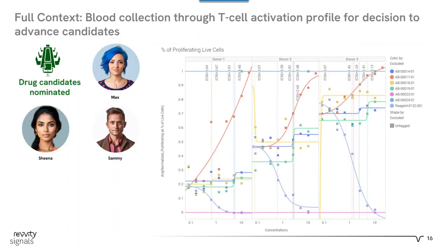Okay, so this brings us to the beginning, as I discussed, where the team is going to meet together to discuss the activation profiles for various drug screenings to advance. Although I don't have time to go into greater detail on the ins and outs of the Signals Research Suite data analysis portion, we have shown the power of Signals Notebook throughout this process and how it connects to a larger ecosystem of the Signals Research Suite.